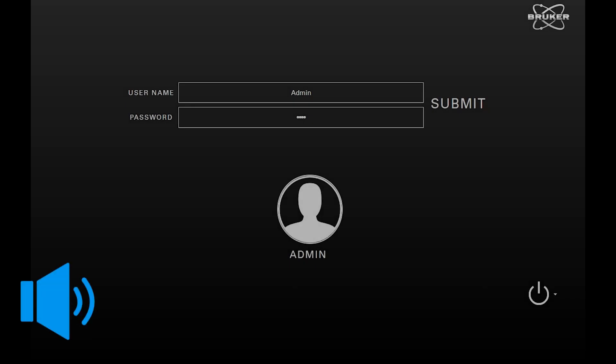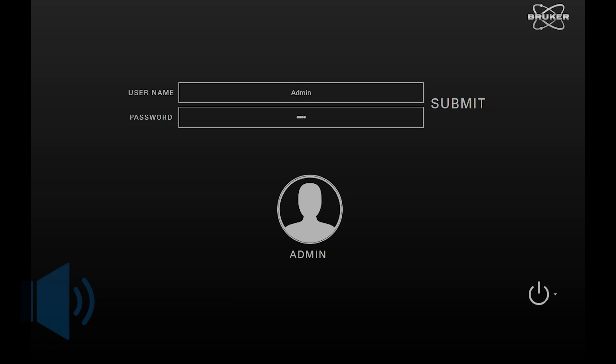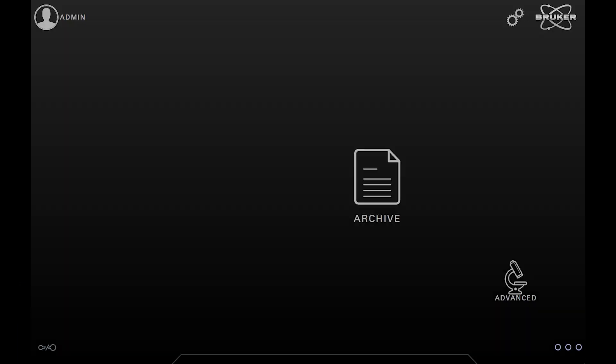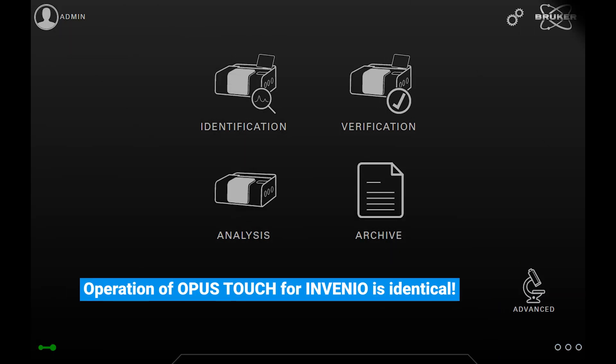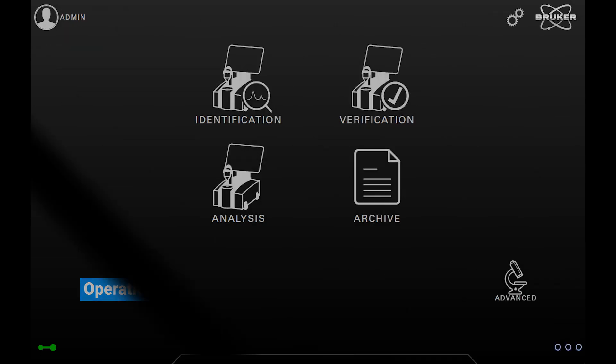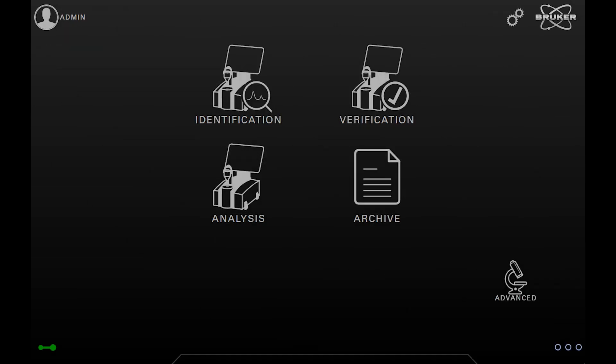In this session, you will learn some essentials about the home screen. The home screen is what you see immediately after login. Here we can see the home screen of the Alpha 2, which can be configured freely.